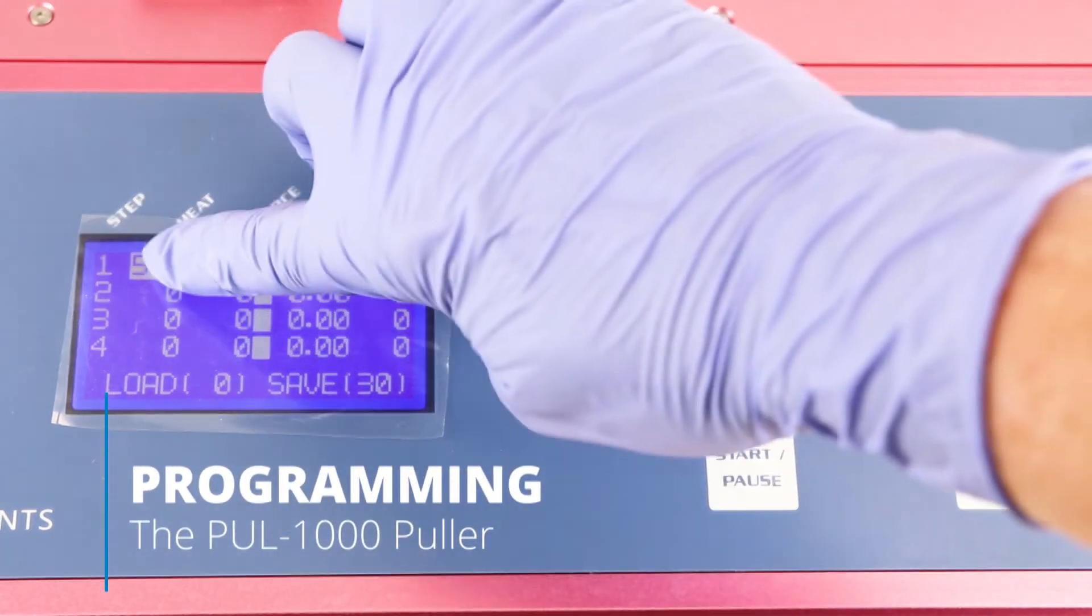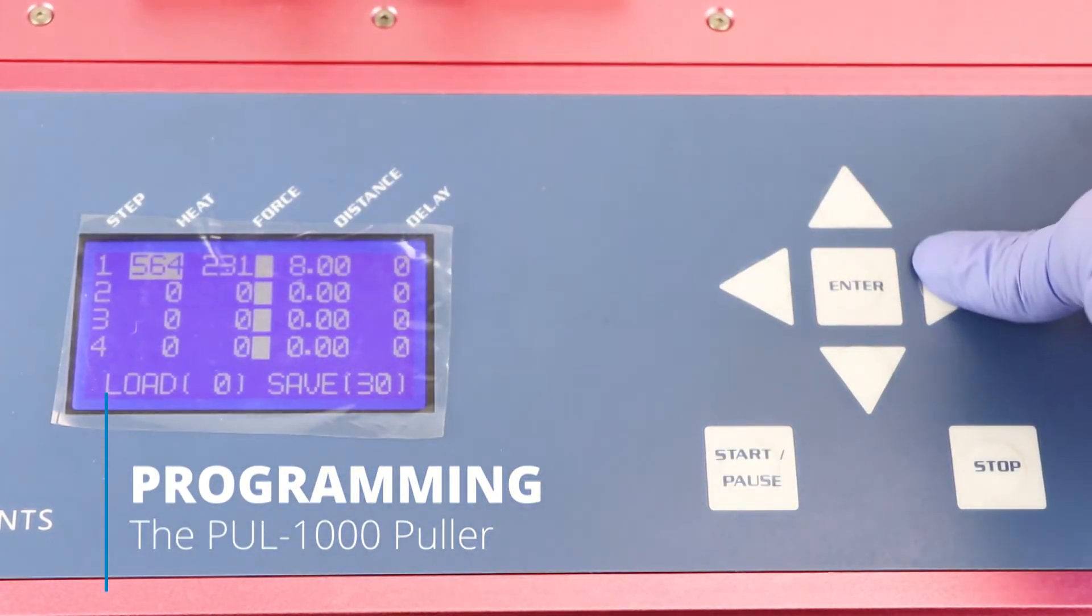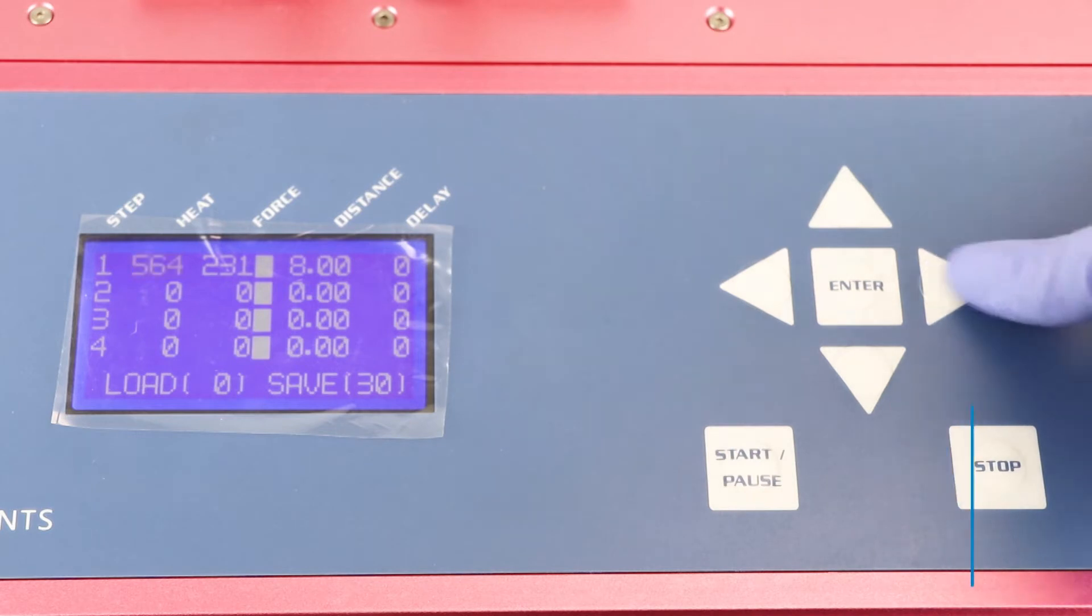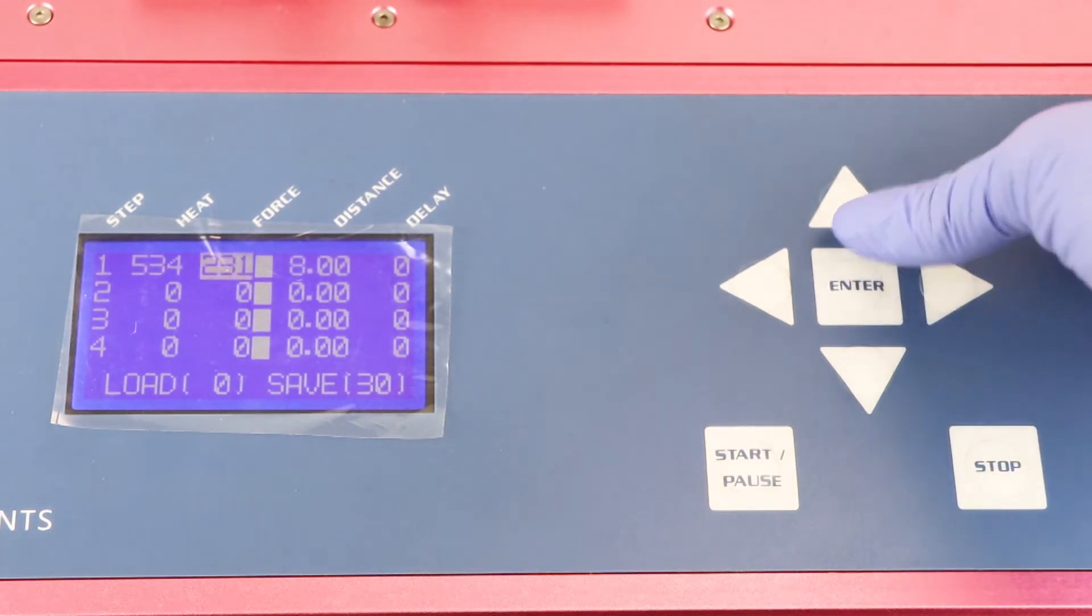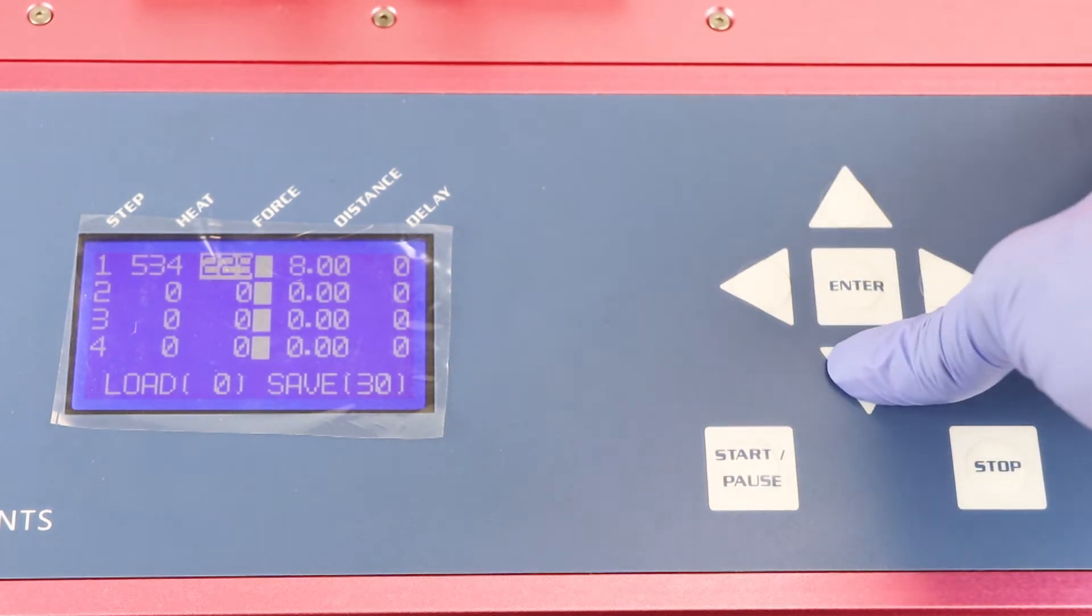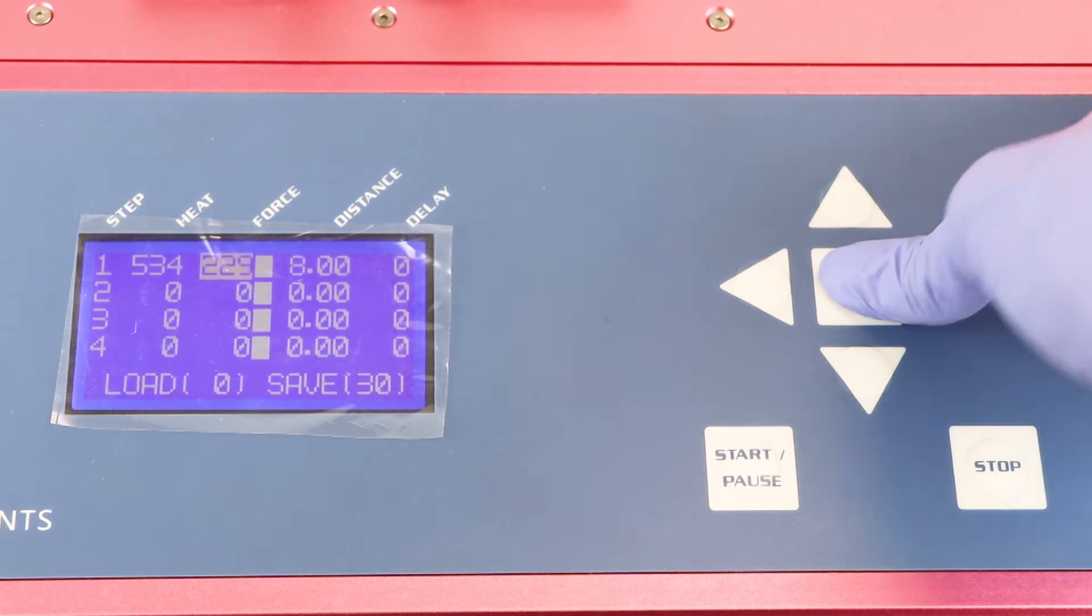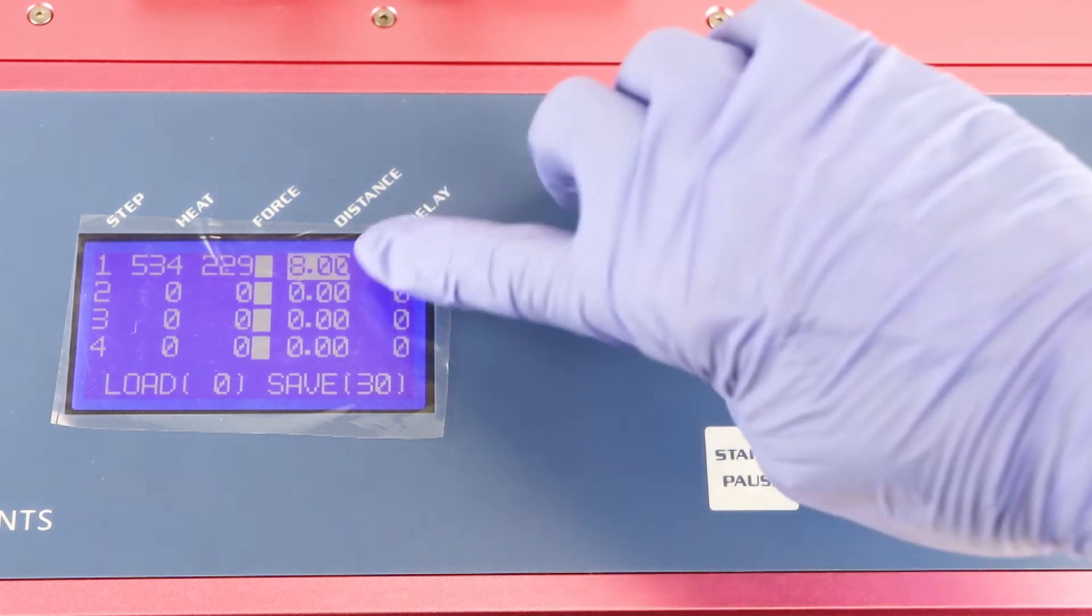The settings for a four-stage pull may be stored in memory and up to 95 programs can be permanently stored in memory. The instrument contains 15 factory-installed programs, so choose from the factory-installed program for a quick start or create your own for precise custom results.